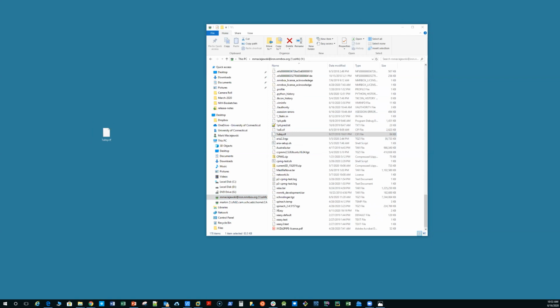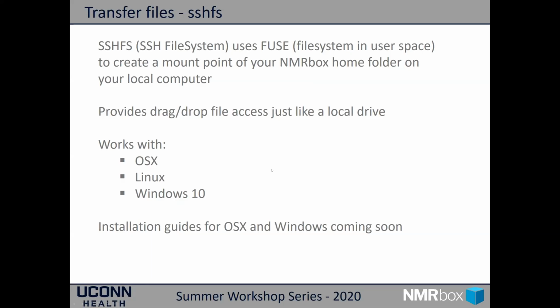Gerard Weatherby actually posted on a new wiki that we have some instructions for how to do this for OS X. At some point today, we're going to get you information about how to access that wiki. I did not get time to update my slides today.